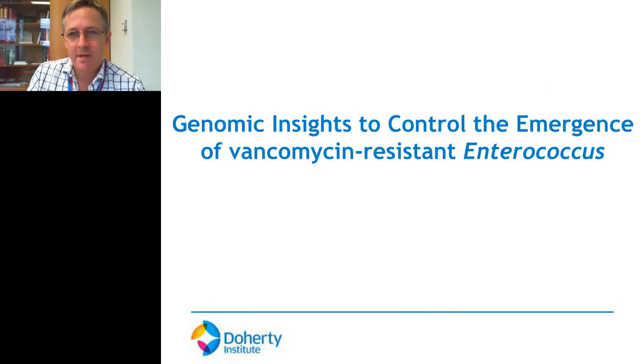So that's all I was going to say about Listeria, but similar to Listeria, you could apply this sort of approach also to other bacterial species and other foodborne diseases such as Salmonella. I guess the problem with Salmonella is that the volume is much higher, so we're only getting tens or possibly hundreds of Listeria each year, but we get many thousands of Salmonella each year. So to make a transition from traditional methods to pure genomics for Salmonella is a lot of work and requires very efficient genomics workflows to make that possible.